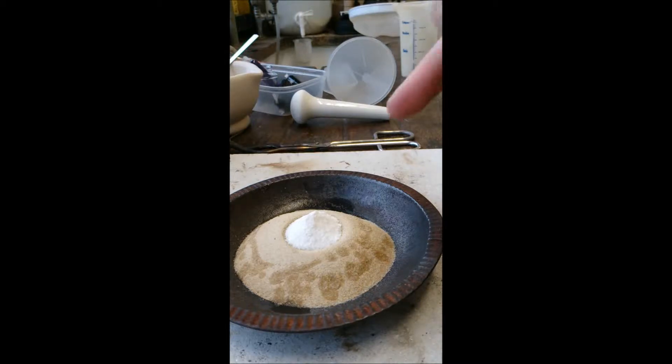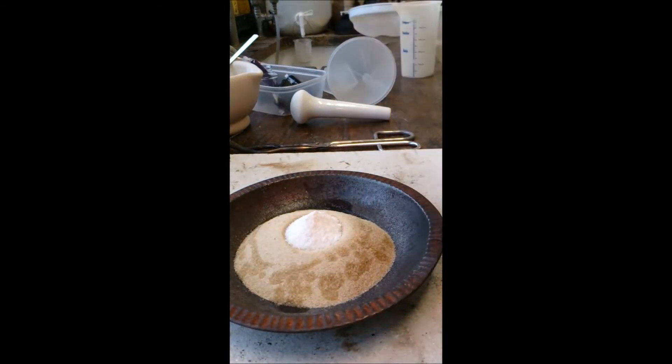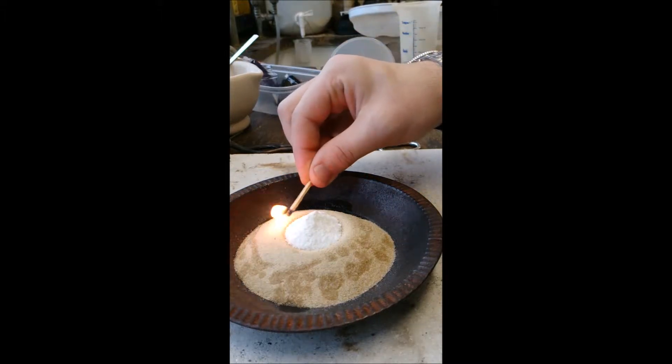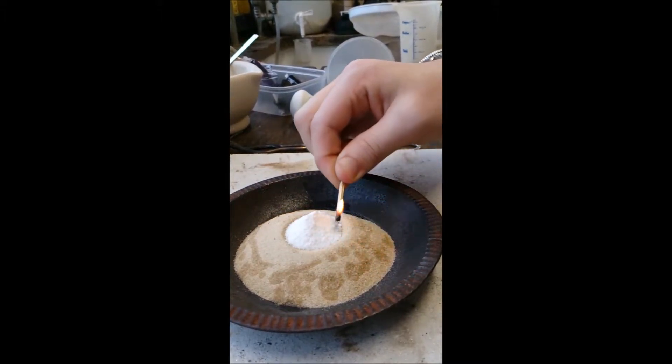Now, what should happen is the ethanol will heat up and will cause the sugar to basically burn. And the bicarbonate will release CO2 which bubbles it up. And it should make something called the black snake.